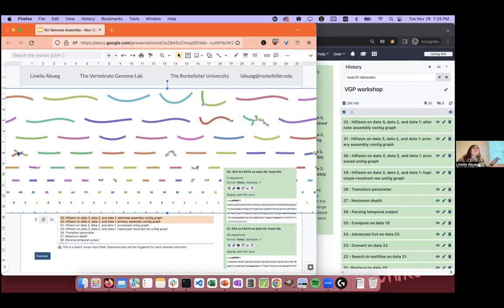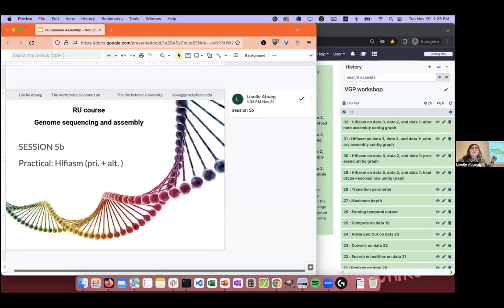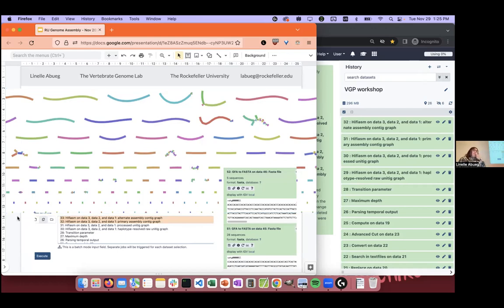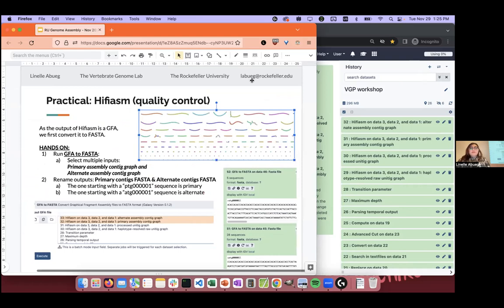But there are still some regions where the assembler's not really sure what the best way to walk is. Some circular regions are a little harder to see, but there's one at the end that might be a repeat where it's not sure of the exact length. And another comment: the reason why you have so many pieces, even in graph space where you should have overlaps with everything, is probably because some overlaps were not correctly defined, so the graph is disconnected.